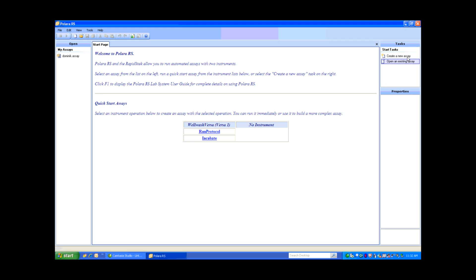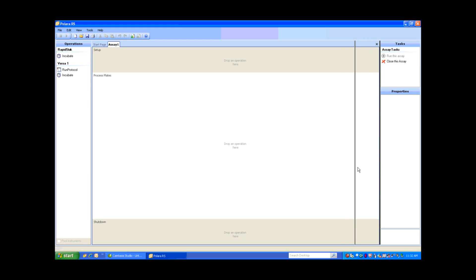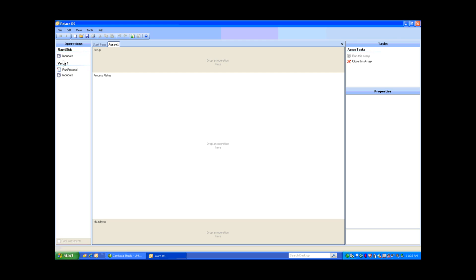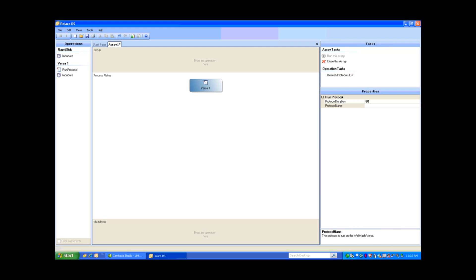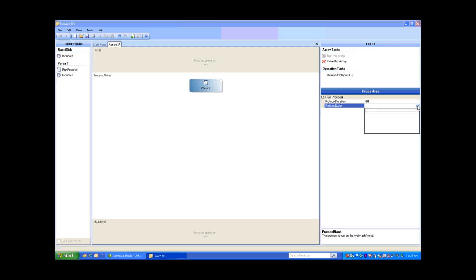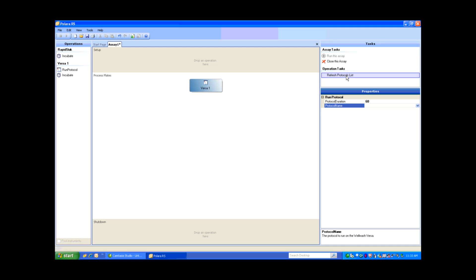Next, I'm going to go to the top right and select Create New Assay. This brings up my Process Editor. The Versa section shows everything I can do with the Versa, so I'm going to select Run Protocol and drag it into my Process Editor. I'll make sure the Versa is selected and go to my Properties. I'd like to pull through a protocol stored on the Versa — right now there's nothing there, so I need to pull those through. I'll go to Operation Tasks and select Refresh Protocol List.